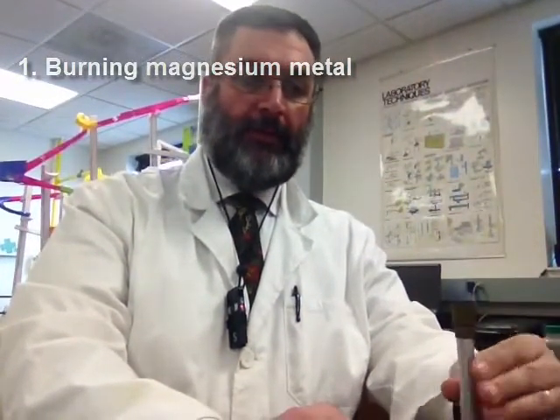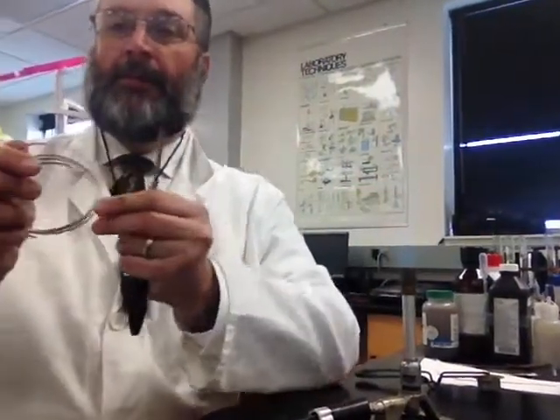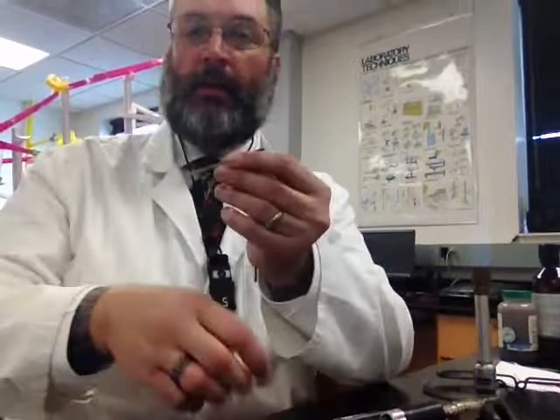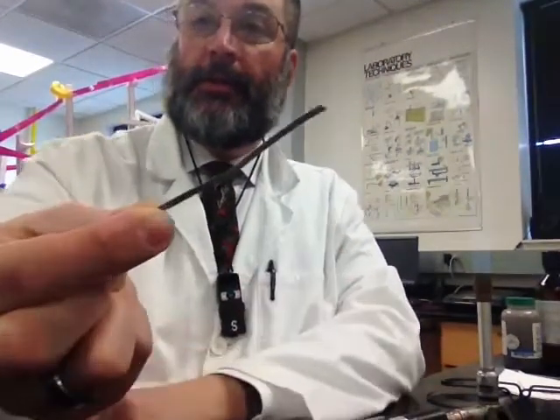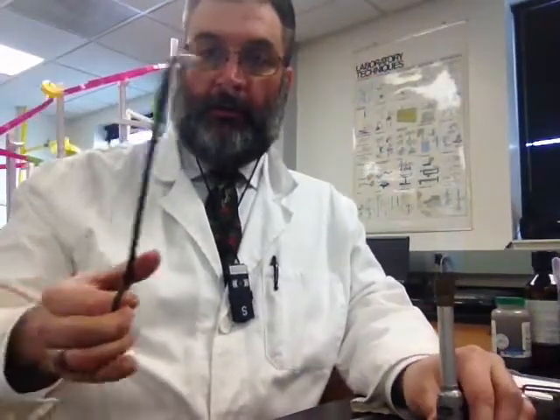we'll need a little flame for this. I have some magnesium ribbon here. Magnesium metal. Looks like this. Sort of a grayish strip of metal. It's very flexible because it is a metal. So we're going to take this and I'm going to put it in the flame for just a second. Okay? And you'll make your observations of this.